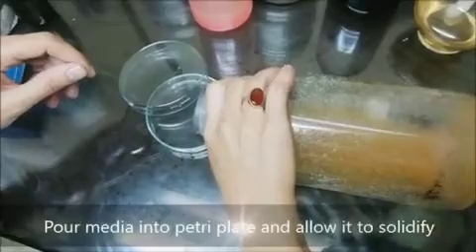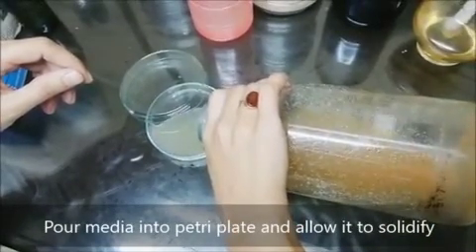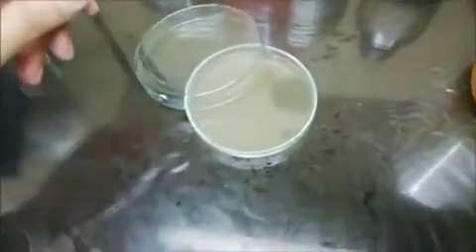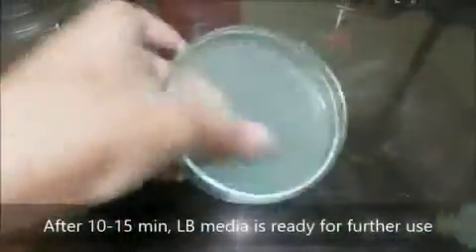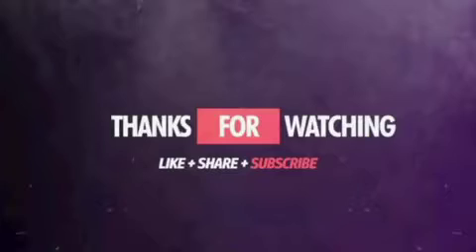Pour the autoclave media into a petri plate and allow it to solidify. After 10 to 15 minutes, the LB media is ready for further use.